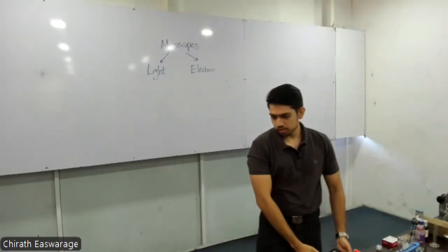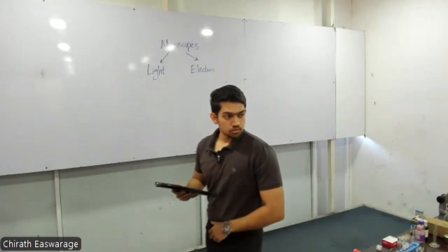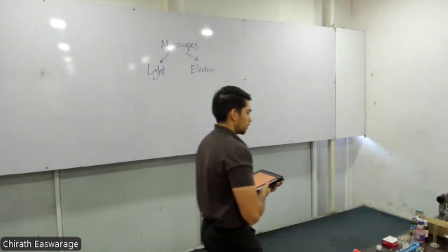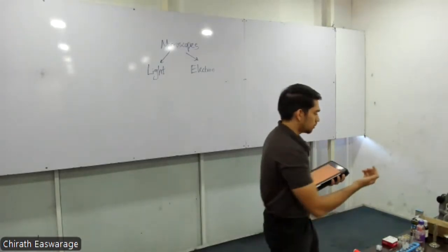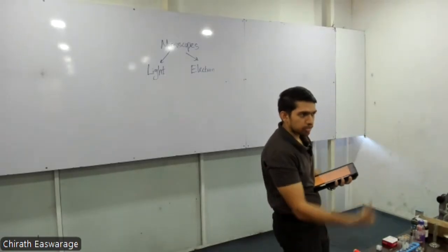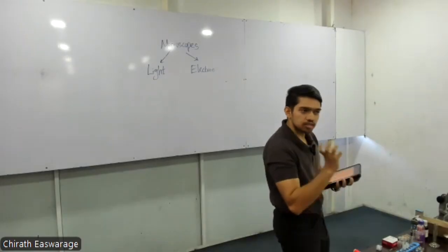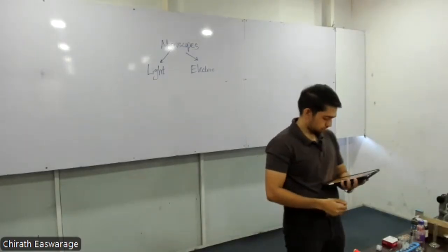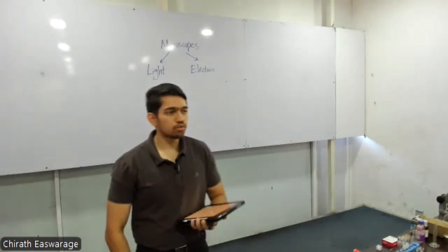Okay, so come to the resource again. Read light microscope. Light is passed through the specimen and then through glass lenses. There is a specimen that is what we are going to observe, that is going to be mounted here. Then there's a light that is going through the specimen and then some glass lenses, then hitting your eye.